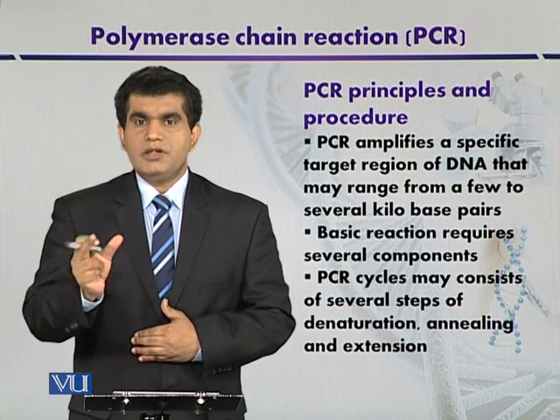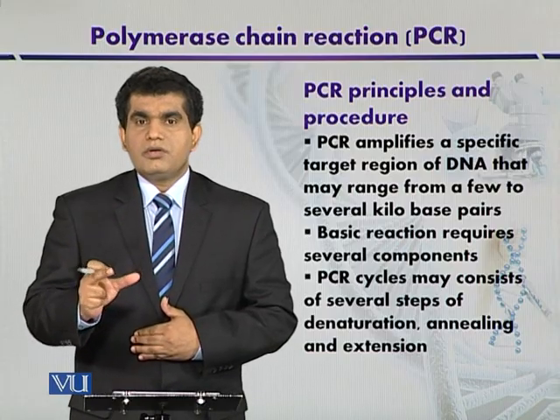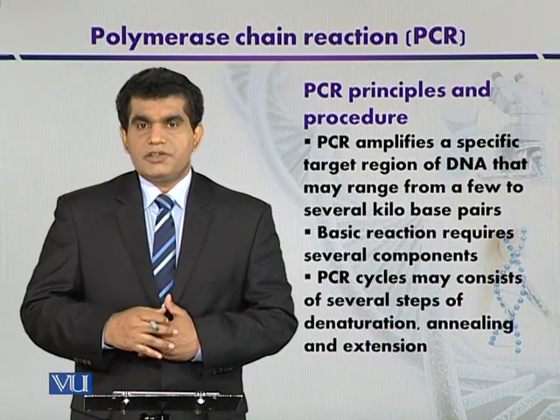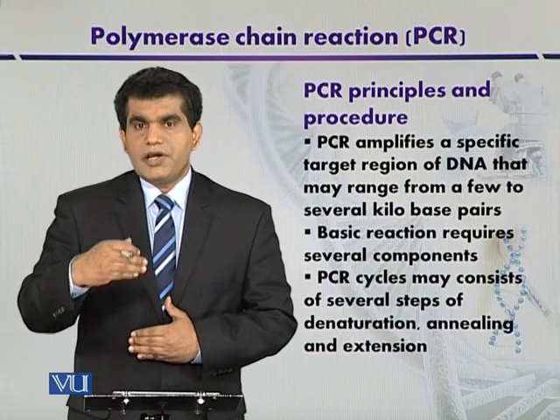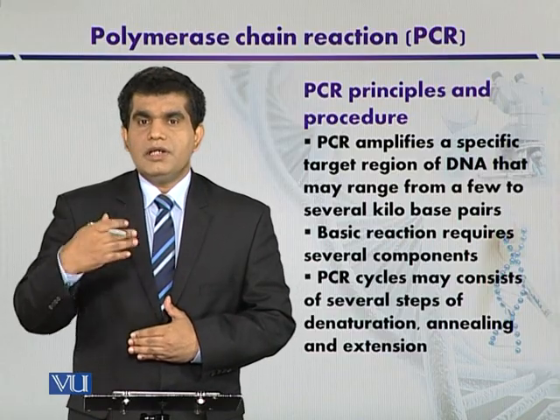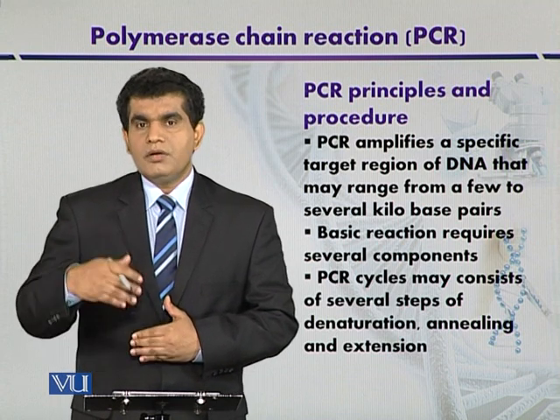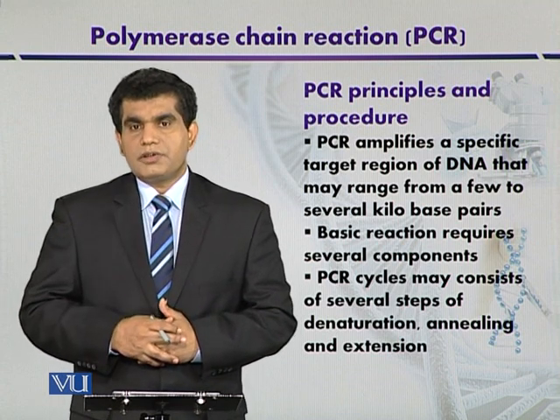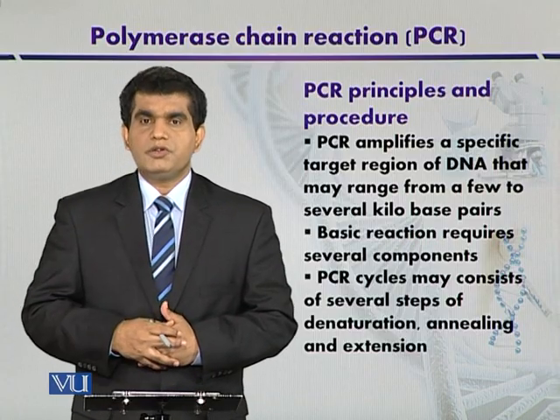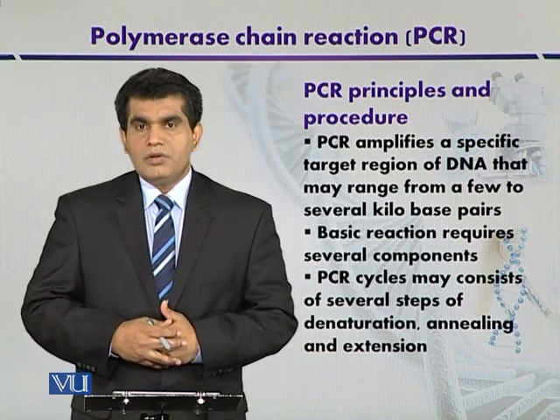Then the next important requirement, it is the availability of the primer, ताकि जो हमने DNA sequence एम्पलीफाई करना है ये उसको फ्लैंक करे, उसको सराउंड करे और फिर उसकी 5 प्राइम टू 3 प्राइम जो DNA synthesis है उसको ये डायरेक्ट करे अकॉर्डिंग टू द इंफॉर्मेशन दैट इज कंटेंड इन द टेम्पलेट और द टारगेट डीएनए। तो इसमें जो प्राइमर की कॉन्सेंट्रेशन है अगेन इट मे बी वेरिएबल डिपेंडिंग हाउ मच रिएक्शन मिक्सचर वी आर गोइंग टू यूज, सपोज इट मे बी 10 or 20 picomole.